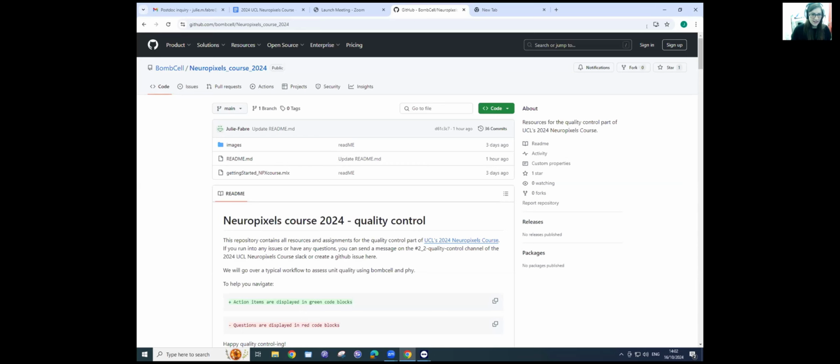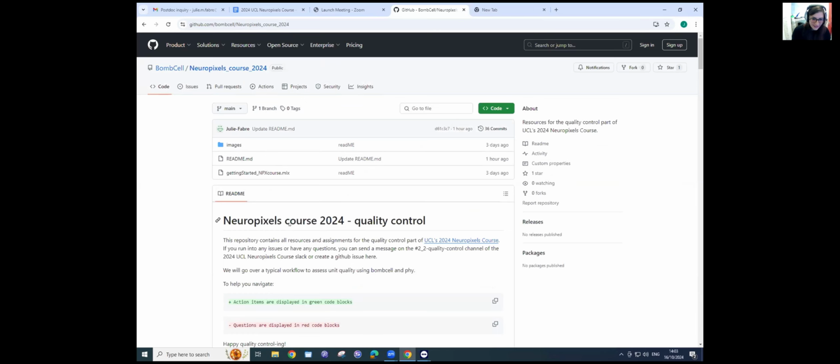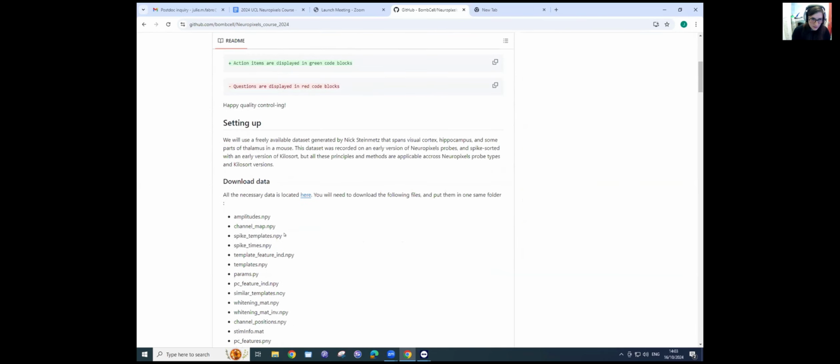Thank you so much. So there were three assignments for yesterday, and I'll talk about the first assignment, which was looking at quality control using Bombcell and a little bit of Phy for manual inspection. You had a whole little exercise in this GitHub repository, and hopefully things went well, but please comment on Slack or add comments here if you had any issues with anything.